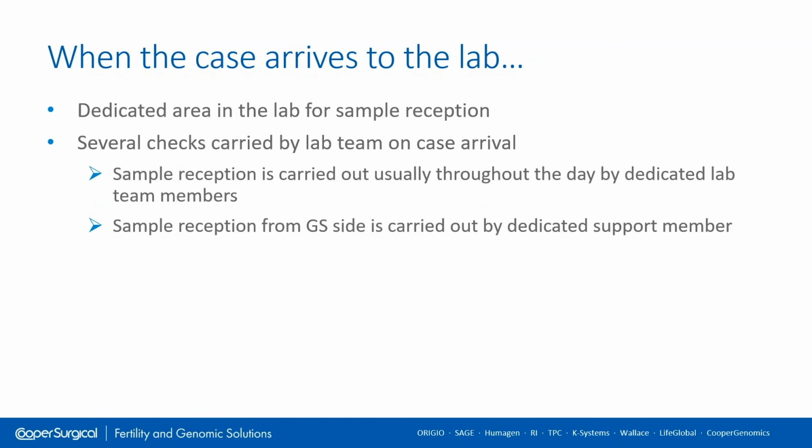When the case arrives at the lab, it lands in the dedicated area for sample reception, and there are several checks carried out by the lab team on arrival. Sample reception is usually carried out throughout the day by dedicated lab team members. From the global support team, there is a dedicated support member who will acknowledge the case to you on arrival.